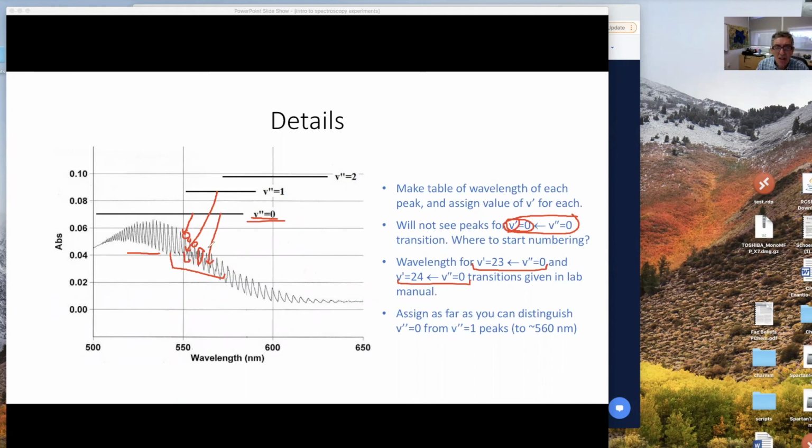So only go as far in your labeling as you're still confident that you can assign the proper peak here. Also, as you go along, these get more inaccurate because the two peaks sort of shift each other inward, so the precise frequency that you need is not going to be quite so accurate. But you can label out to maybe this far or something. So I think this is all that you need.